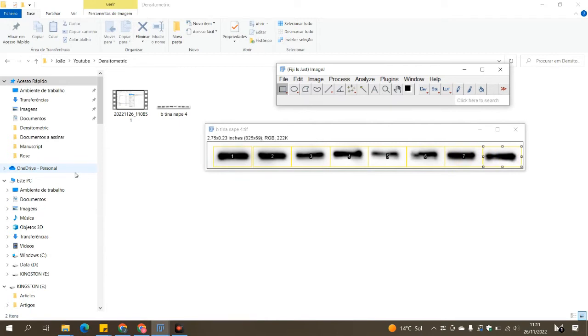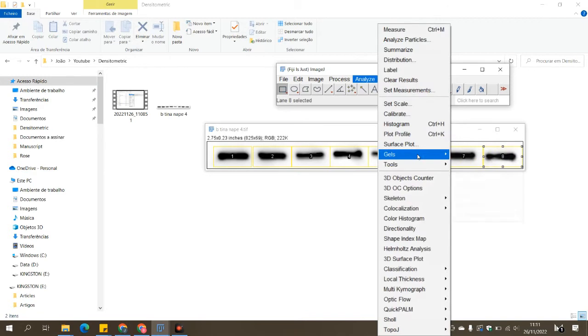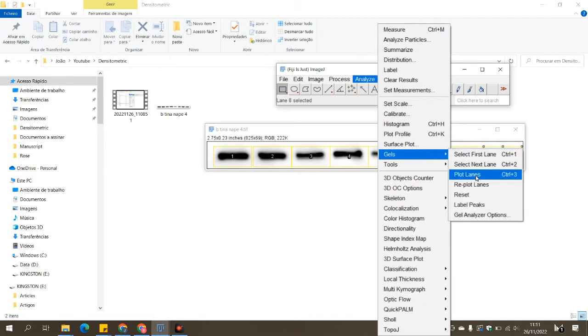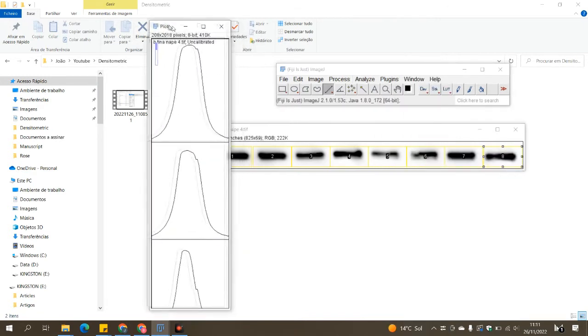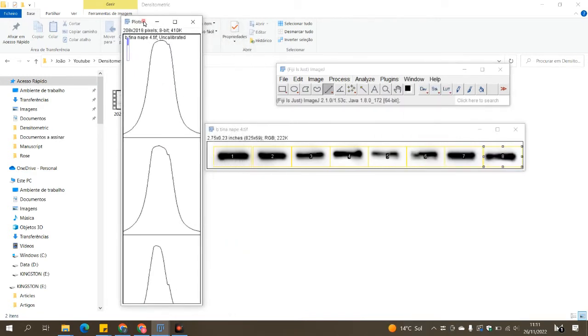Now once you have all the bands selected, you go to analyze and plot lanes, and a new window will show up with these graphs.